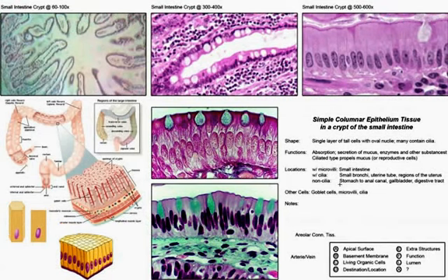Okay, this is in the small intestine and digestive tract. This is probably right here the best microscopic depiction of these columnar cells in this location. A basement membrane down here closest to the nuclei would be present. We would have a number of different structures below this lining.